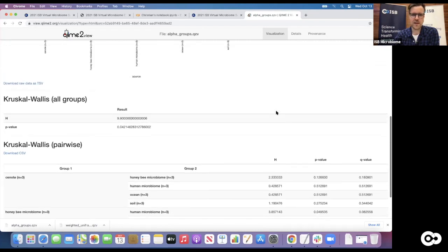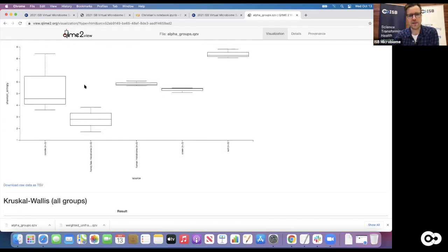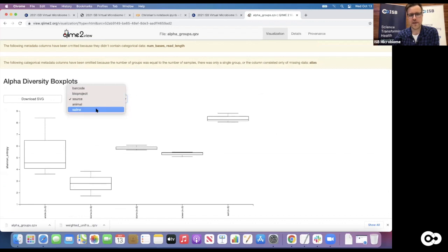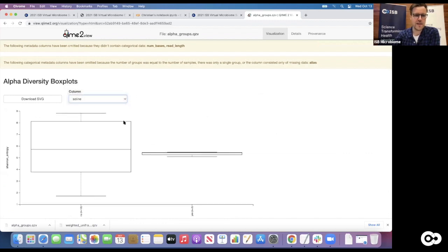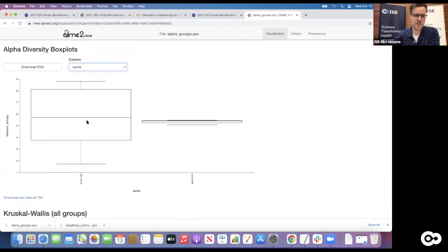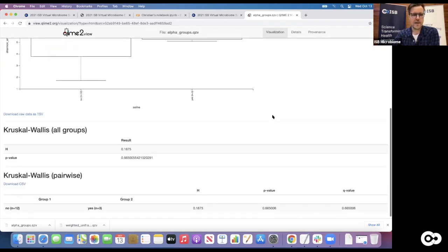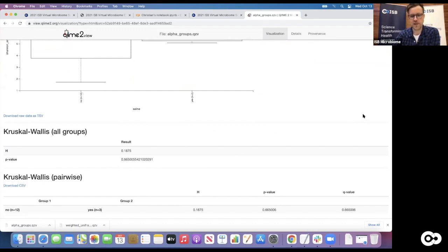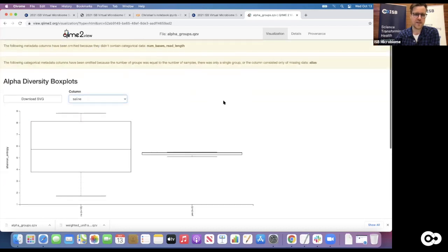For instance, the ocean and human microbiome look like they have pretty similar alpha diversity here - we could check that out and actually in our case we don't get a corrected p-value that's significant. You can also look at other variables, like samples from saline versus non-saline environments. The ocean has a lot of salt - comparing those two groups, we see that they would be expected under the null hypothesis where everything is generated from one distribution. So that gives you some hard numbers and statistics you can actually use to compare those groups.